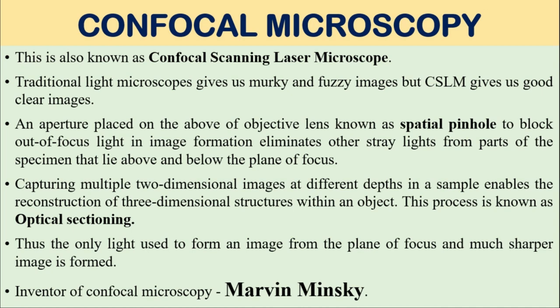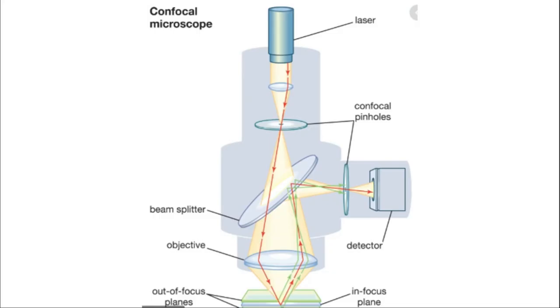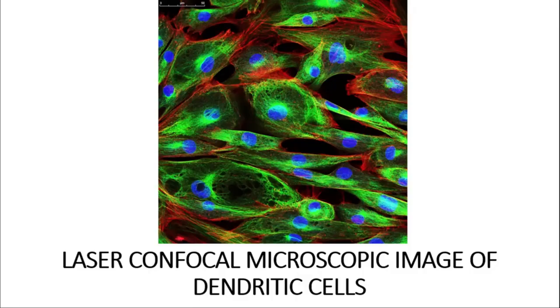Inventor of confocal microscopy. Who invented confocal microscopy? Marvin Minsky. Do not forget this name. Marvin Minsky is the inventor of confocal microscopy. This is the structure of confocal microscopy. Laser confocal microscopic image of dendritic cells.